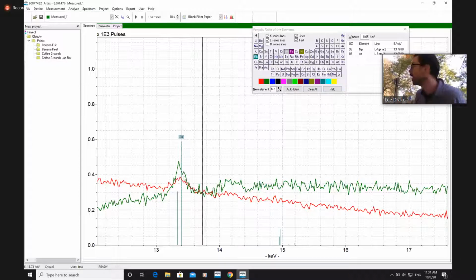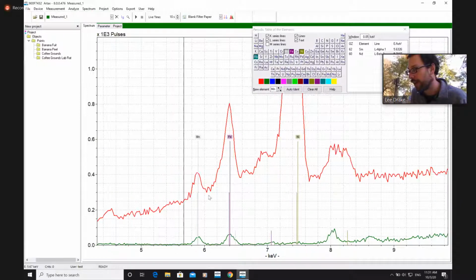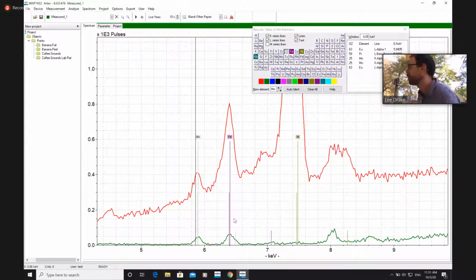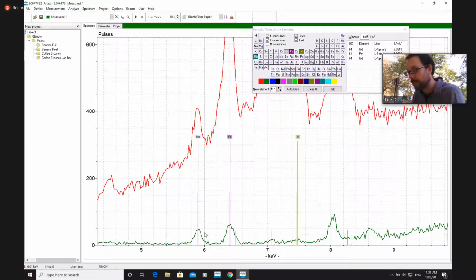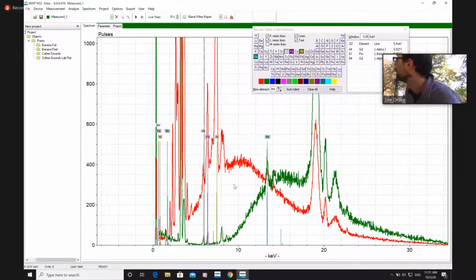So that's good news. The filter helped us see that rubidium, and when it came down to iron and manganese, it knocked it out of the park, right? Our baseline is 0. And if we look, what our filter basically did is it's like Cookie Monster taking a bite out of the cookie, right? Like we just took a bite out of all that excess radiation that was causing us all those problems.